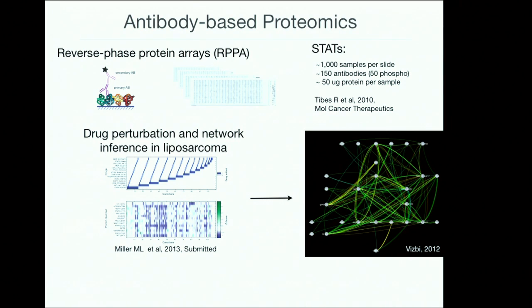So we had a challenge of visualizing this many different models onto a set of nodes. So we tried to incorporate multiple edges between nodes. But since this is not about networks, we're going to hear Scooter talk about that in a moment. I'm not going to focus on this, but I just wanted to talk about our work in the TCGA consortium. So we're also involved in the Cancer Genome Atlas, and here again, Gordon Mills in Texas and his group have profiled many samples now with the reverse phase protein arrays, and we've incorporated this into the CBio Cancer Genomics portal.